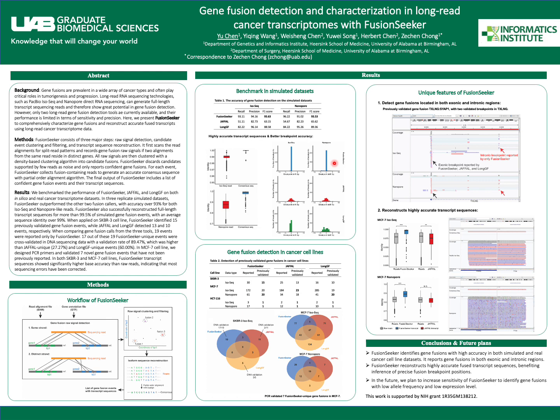Today I'm going to present a poster about my project, Gene Fusion Detection and Characterization in Long-Read Cancer Transcriptome with FusionSeeker. So what we did is basically develop this package called FusionSeeker that can be used to identify gene fusions in the long-read RNA sequencing of cancer samples, and also to reconstruct the transcript sequences for those gene fusion events we have identified. We can probably start from the methods here.